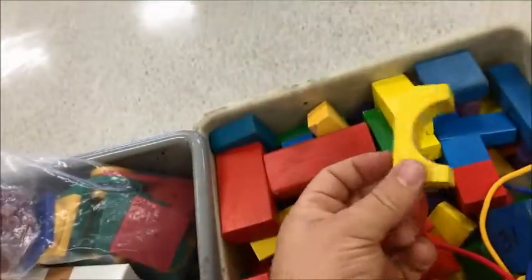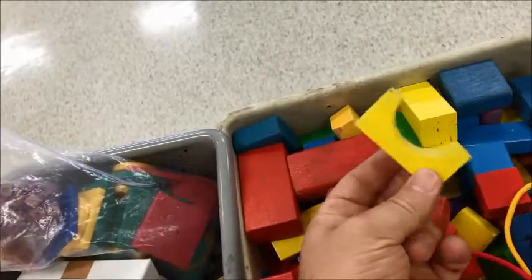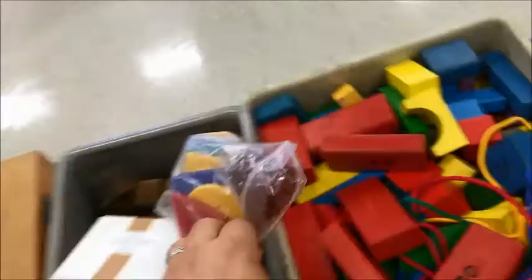So you're going to figure out the density of 3 objects. Is it going to be exactly these 3 objects? No. You can pick any 3 regularly shaped objects from our selection. Maybe you should avoid these ones, unless you're really good at geometry and can figure out the volume in a complex way. But there you go. Stay tuned for part 2, where we're going to do irregularly shaped objects.